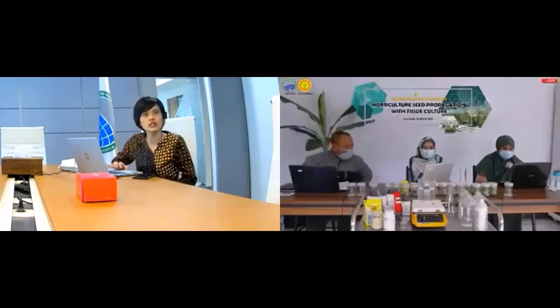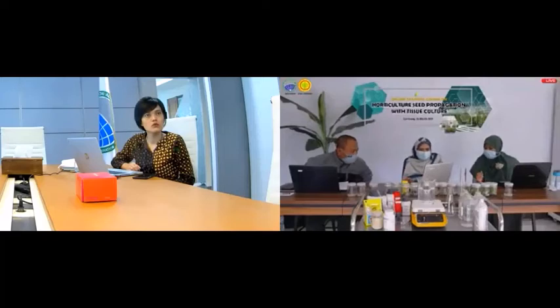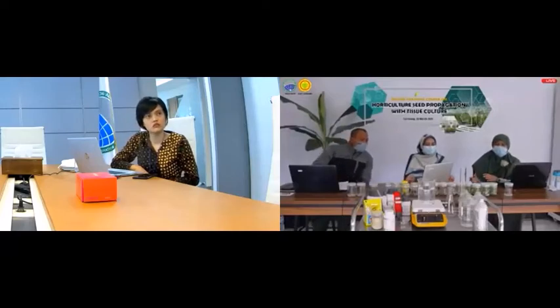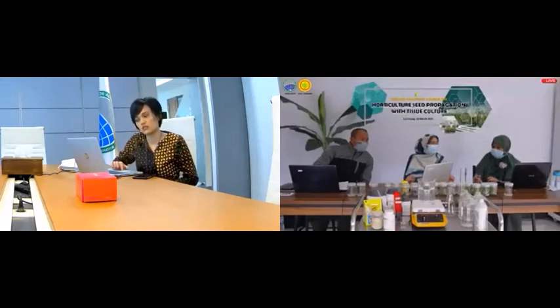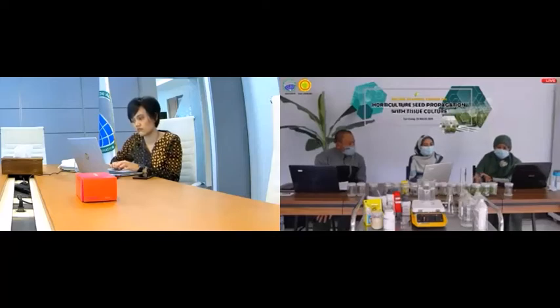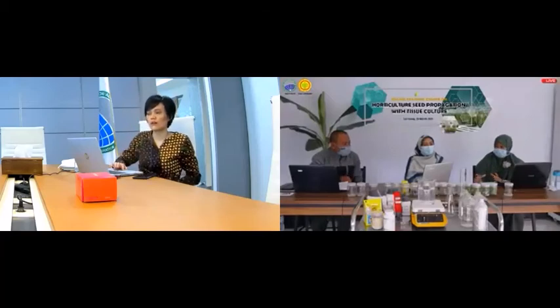Okay, Miss Lodini, would you like to add more comments? Maybe I can add a little. Tissue culture might be a tricky method for micropropagation. That's why sometimes we use different media to grow different plants or plantlets. We need to try and learn about the composition of the media, the time of sterilization, and everything. What we do here is for the banana plant, which is suitable for us here in Indonesia, with our climate and everything.